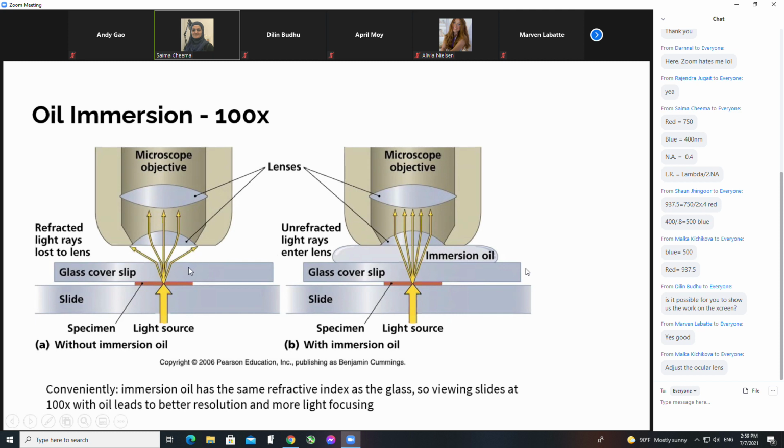And that light is extremely important, not just for illuminating the specimen, but also for seeing fine detail. So as you increase the magnification, there is a smaller and smaller distance, and the objective lens has to be better and better at trapping light, as well as just the quality in general so that you can see detail.